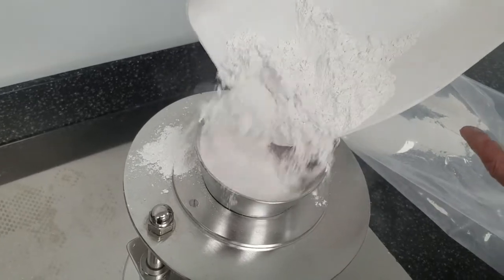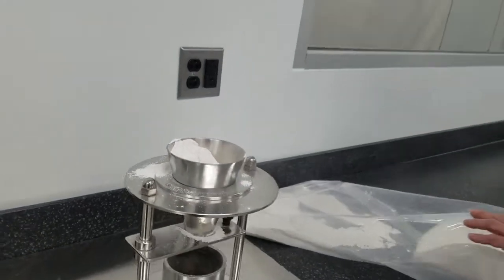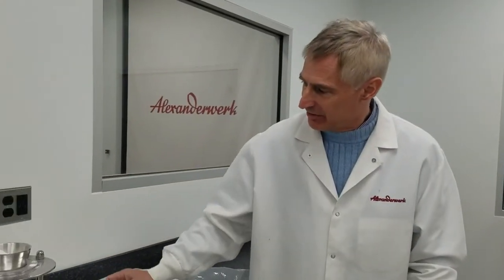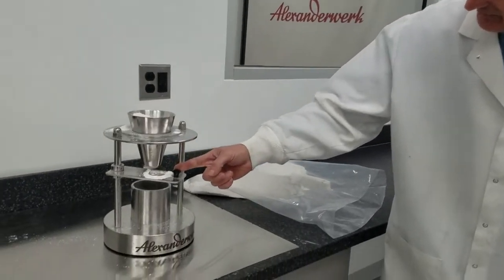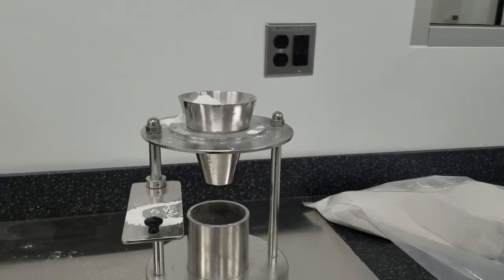You can see the material is very fine, very dusty — and we can also assist with the dust issues that you have with this particular material. The material is now in this feed hopper here. I'm going to open this discharge valve, and you can see the material just does not want to flow into my collection or sample cup below.